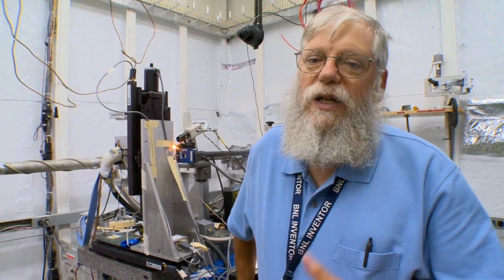Typical X-ray fluorescence microprobe instruments operate rather slowly. They measure one little dot on the pixel every second or so. This experiment allows us to integrate the scanning stage and the detector acquisition, so we can have a dwell time of a few milliseconds. That's about 1,000 times faster than typical. And so that means you can really scan a macroscopic object, like a picture, in a couple of hours and get a nice high-resolution image.